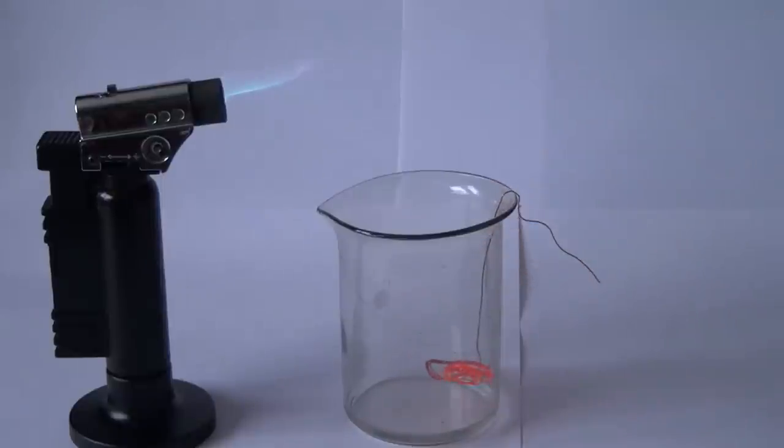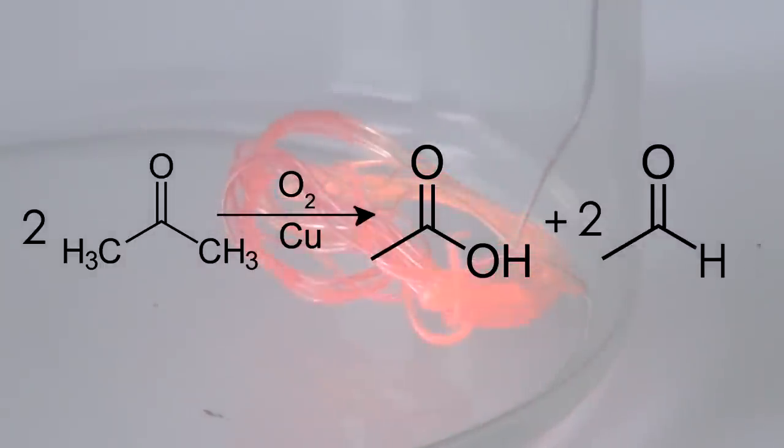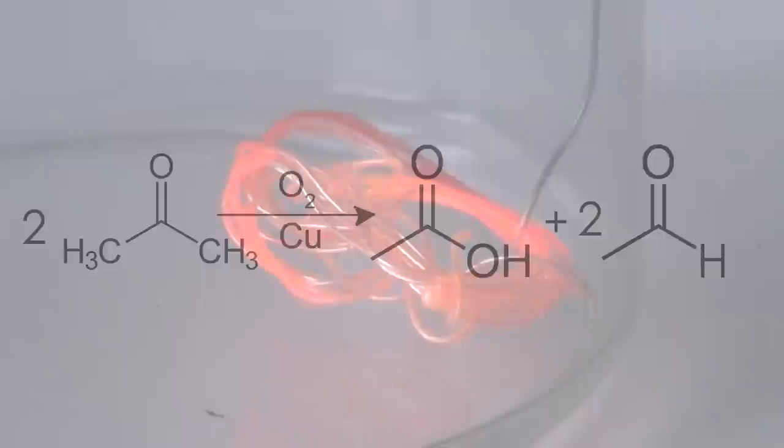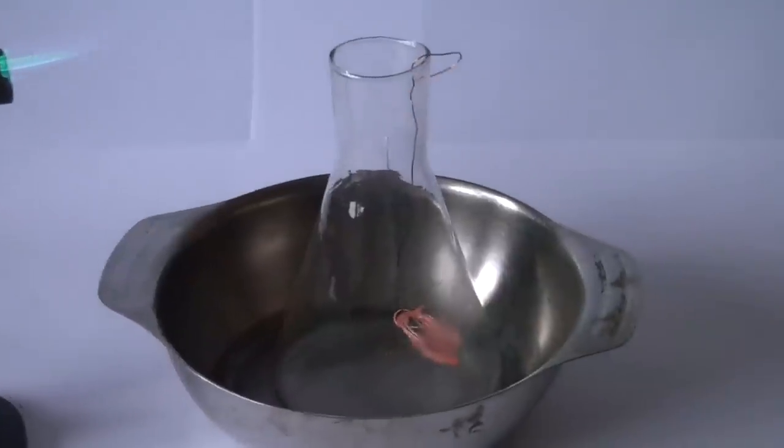Acetone vapors are oxidized to acetaldehyde and acetic acid at the surface of the wire. Acetone catalytic oxidation occurs. If you use a flask instead of the beaker, the wire will glow a little brighter.